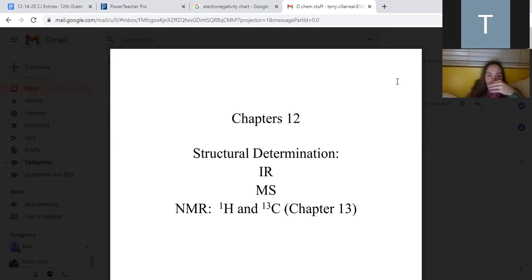And we can figure out, is it a carbon that's only connected to other carbons? Is it a carbon that's double bonded to other carbons? Is it a carbon that's connected to things like an oxygen or nitrogen? IR and carbon 13 are going to be your simplest ones. H1 proton spectroscopy takes a little bit of work, but it helps you out and it's really easy once you get used to it. Mass spec can be tricky and it just depends on what your instructor wants you to learn from it.